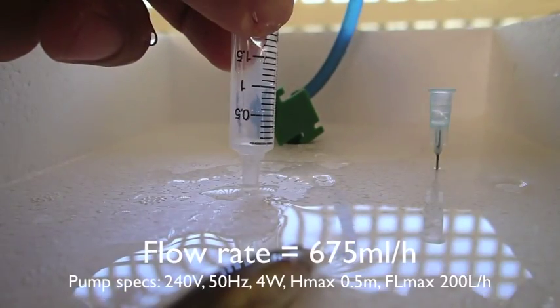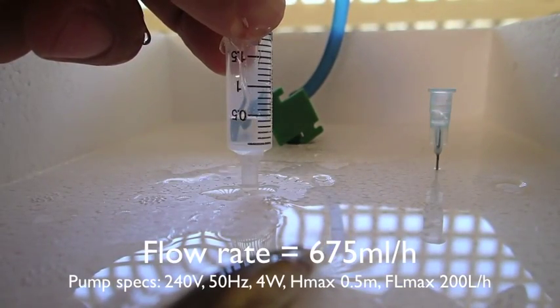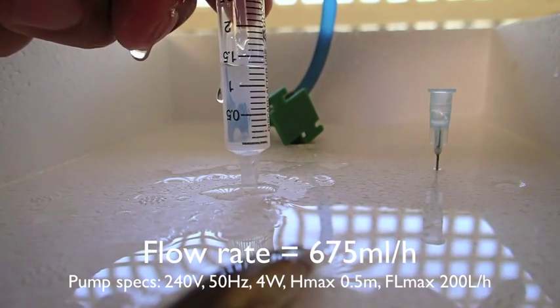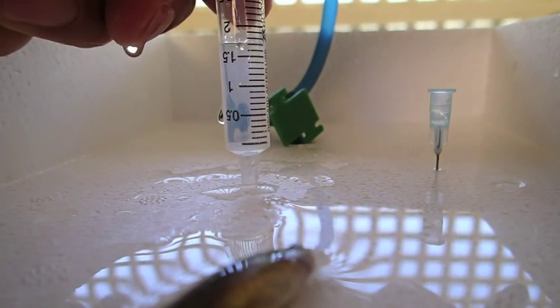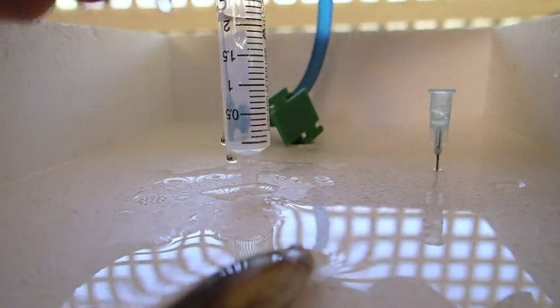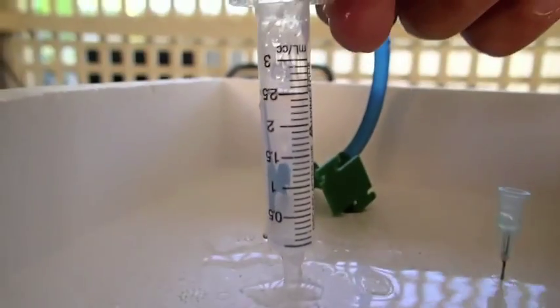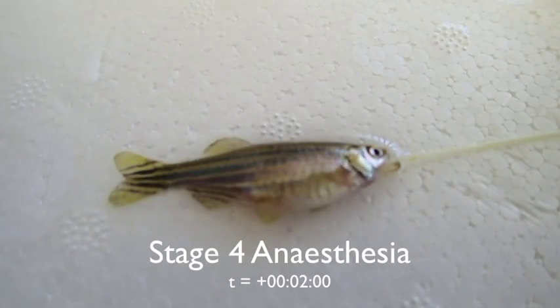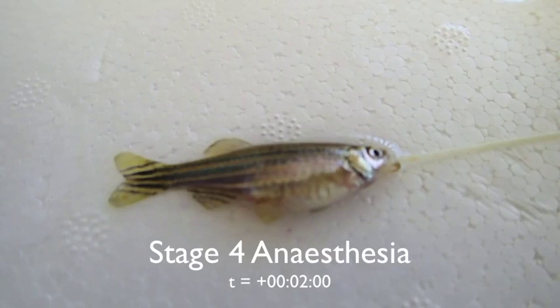Here we're just showing you how quickly the water is passing by. We've got the specifications below, and we calculated that it took about 16 seconds to fill a 3 ml syringe — that equates to just a little over half a litre per hour.